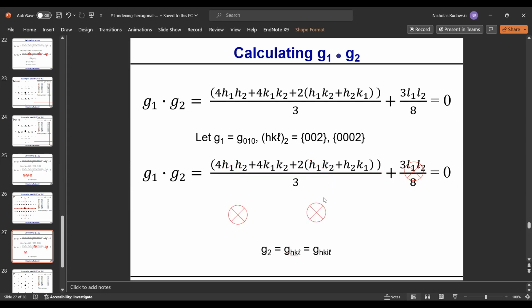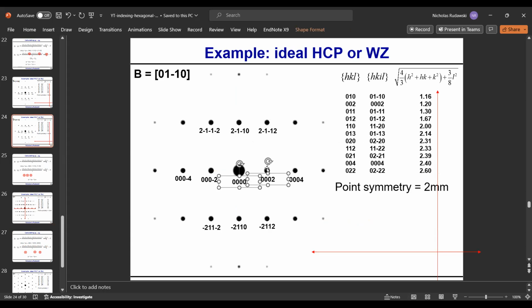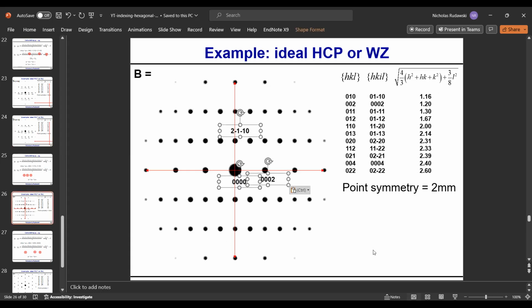No question at all. So for the sake of making this easy, let's just do 0002 to make the math nice and convenient, so we're using fewer negatives. So when we come back here, that's 0002.